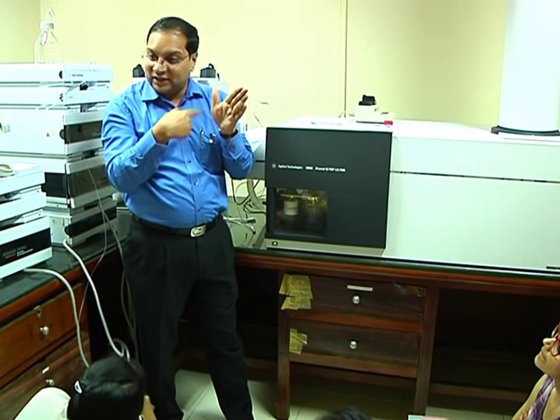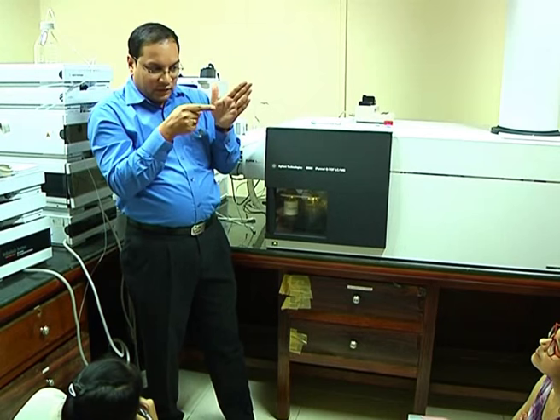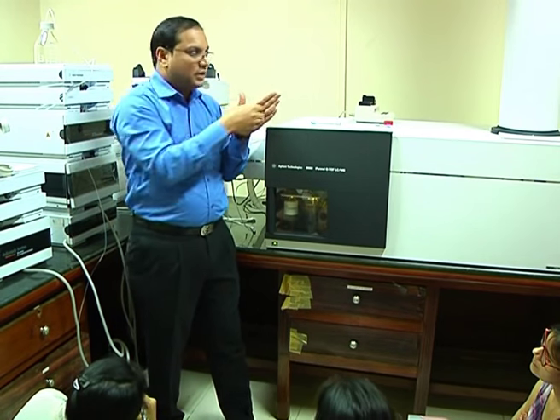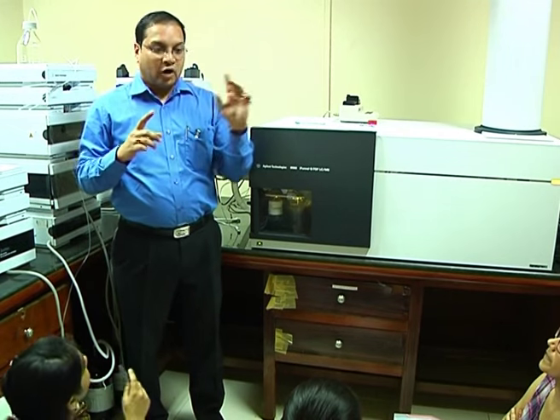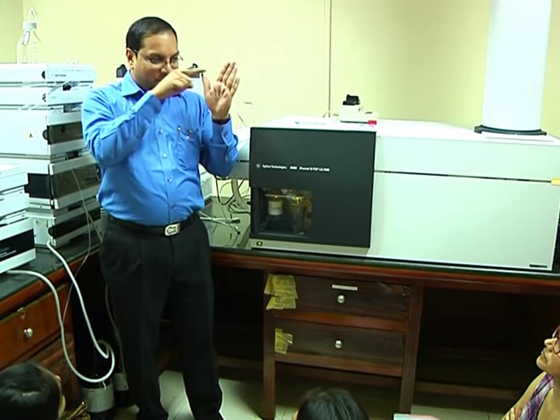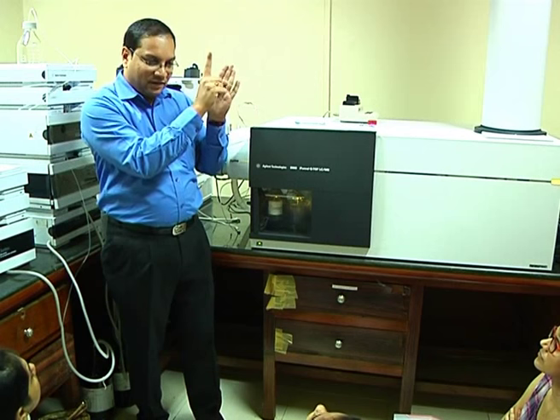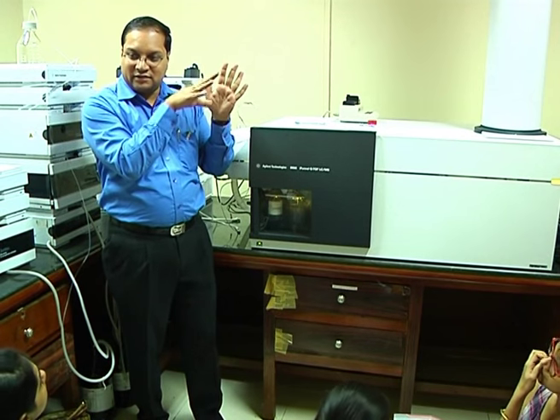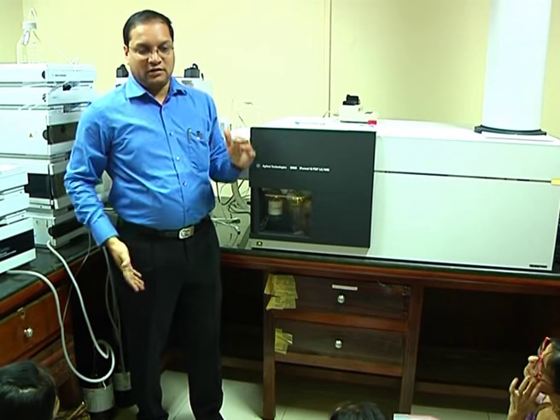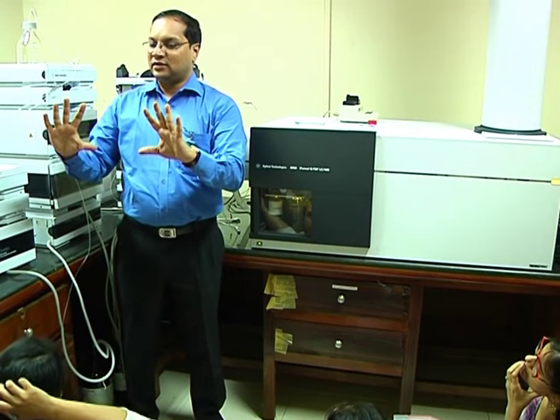That is why it is in tandem, it is talking. It has scanned, it has told to pick 8, and coming back, it will pick up only those 8 in the same cycle, fragment those and give it back. So now the TOF will stitch the information, because it has the scan, it has the MS of the 8. It knows which are the precursors at MS level, and it knows what the fragments of that precursor are. So it will stitch the data, so it will have an MS and MS/MS of that peptide stitched together, and as a user I can see it comfortably on my desktop.